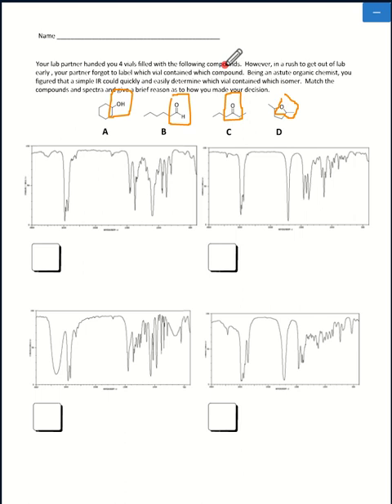When it comes to linking each molecule to its respective IR spectra, really it's just start with the functional groups that you have, and then use the web link in the experiment 4 folder on Blackboard. There is an IR web link to a table of a great variety of IR values.